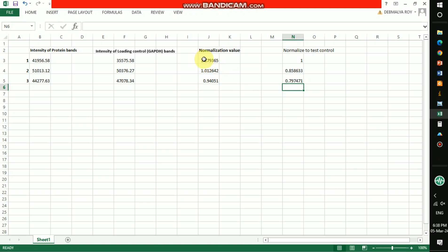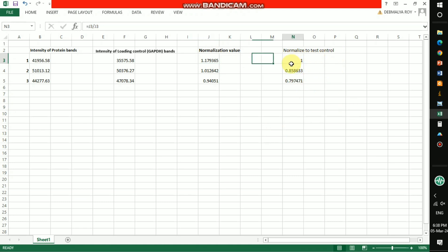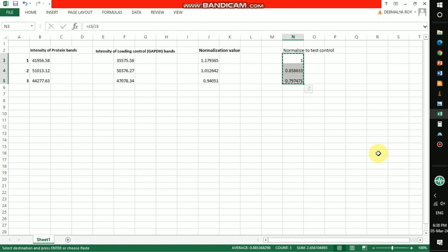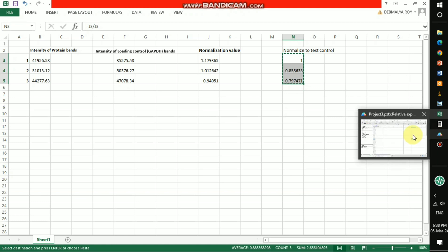Remember, the first normalization value is the control. After dividing, the control will always equal 1. I got the final normalized values and need to put them into a graph in GraphPad Prism. Here is the Prism graph.